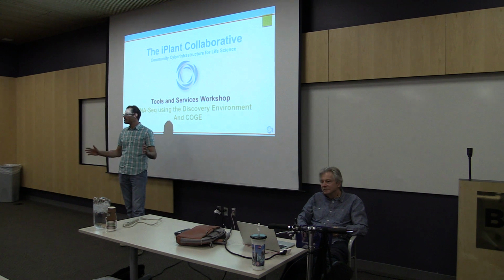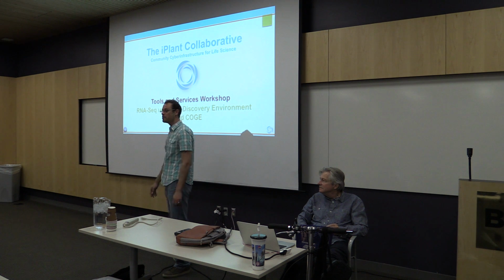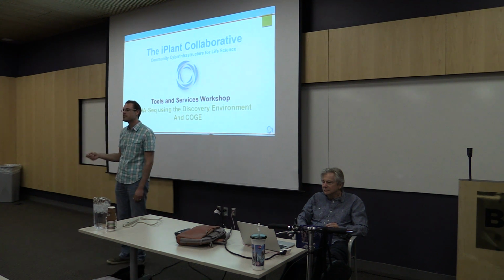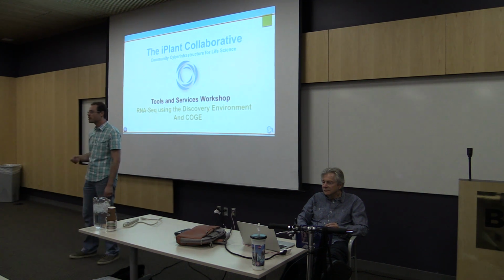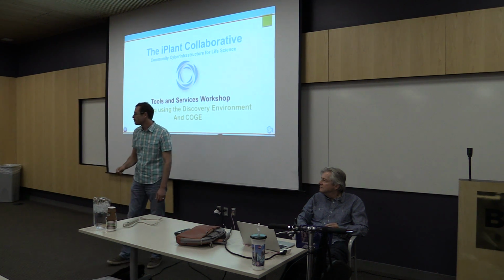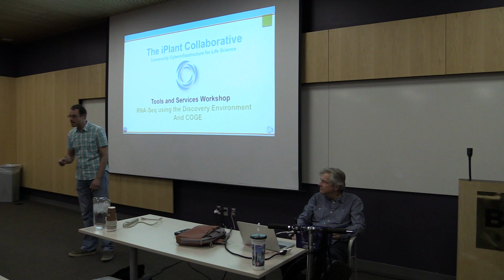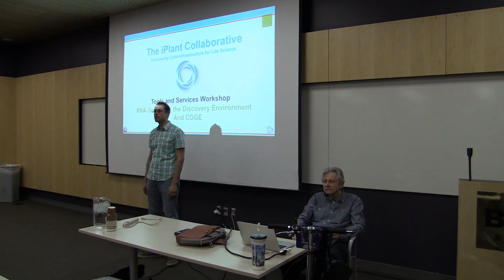Anytime. All right, so let's begin. Today we're going to be covering how to do RNA-seq with iPlant, specifically internal to one of its flagship products known as the Discovery Environment. For people that were here earlier in this workshop series, we have used the Discovery Environment for data management. The other half of that platform lets you integrate pretty much any tool that runs on the command line of Linux, and then use the data that you have in your data store to run through those specific tools.